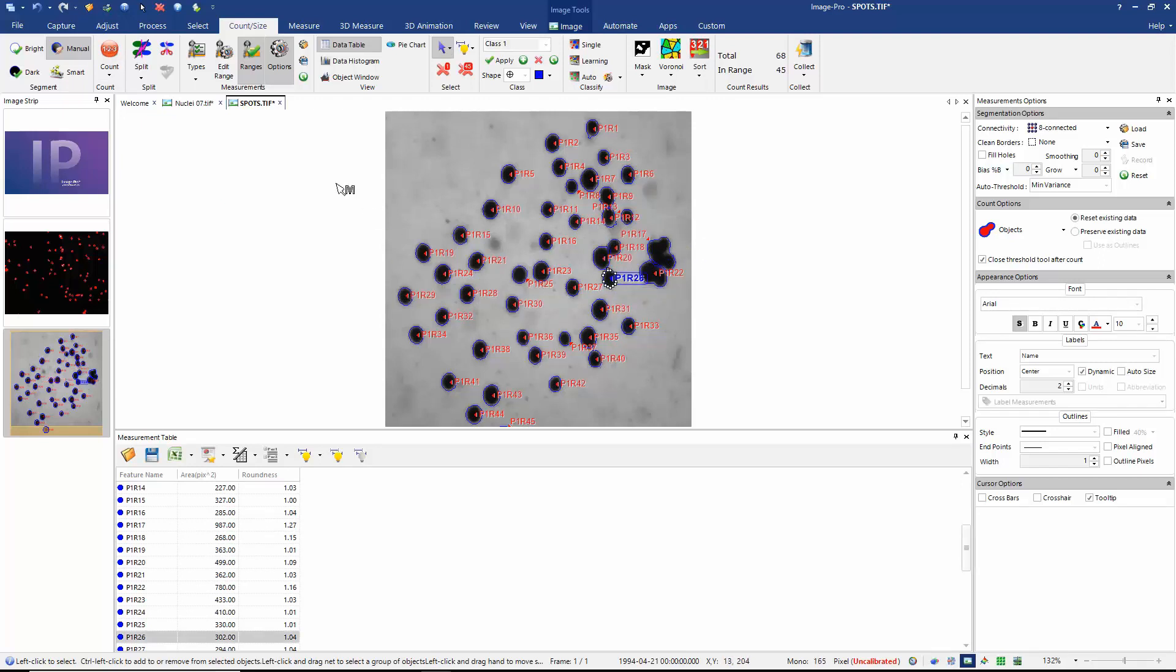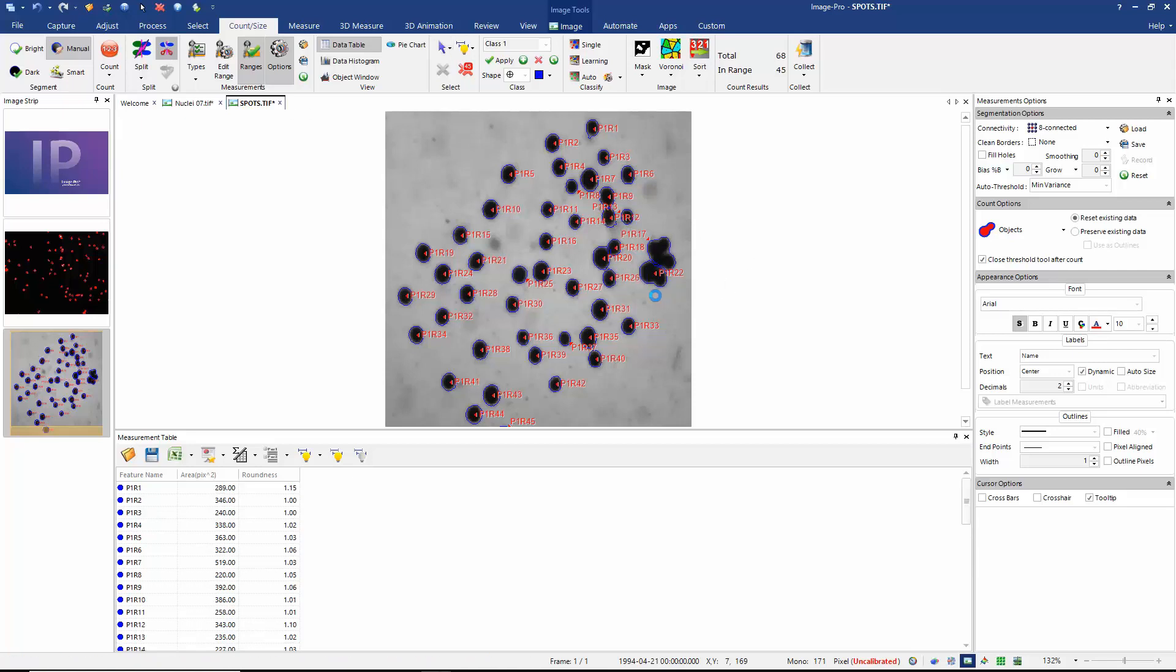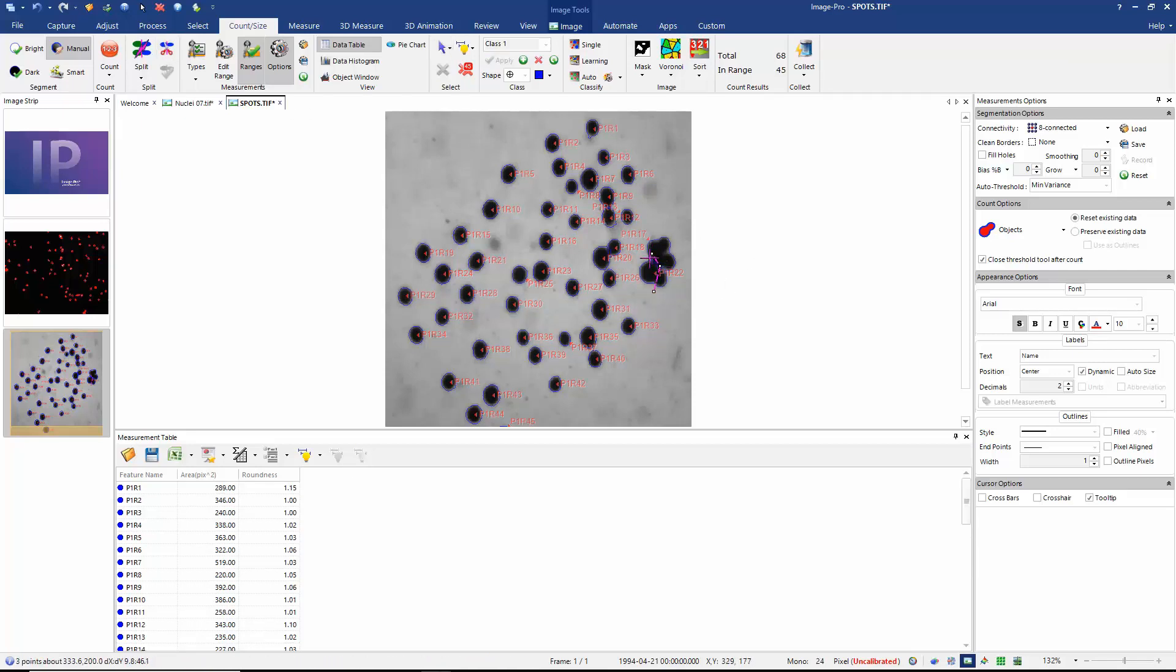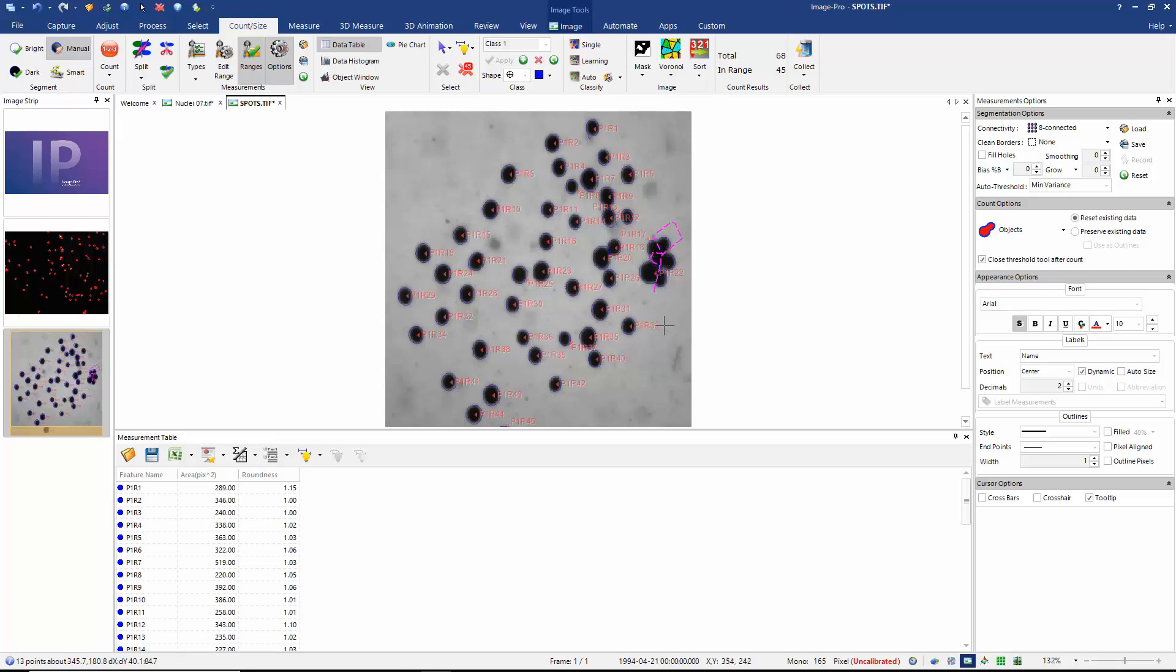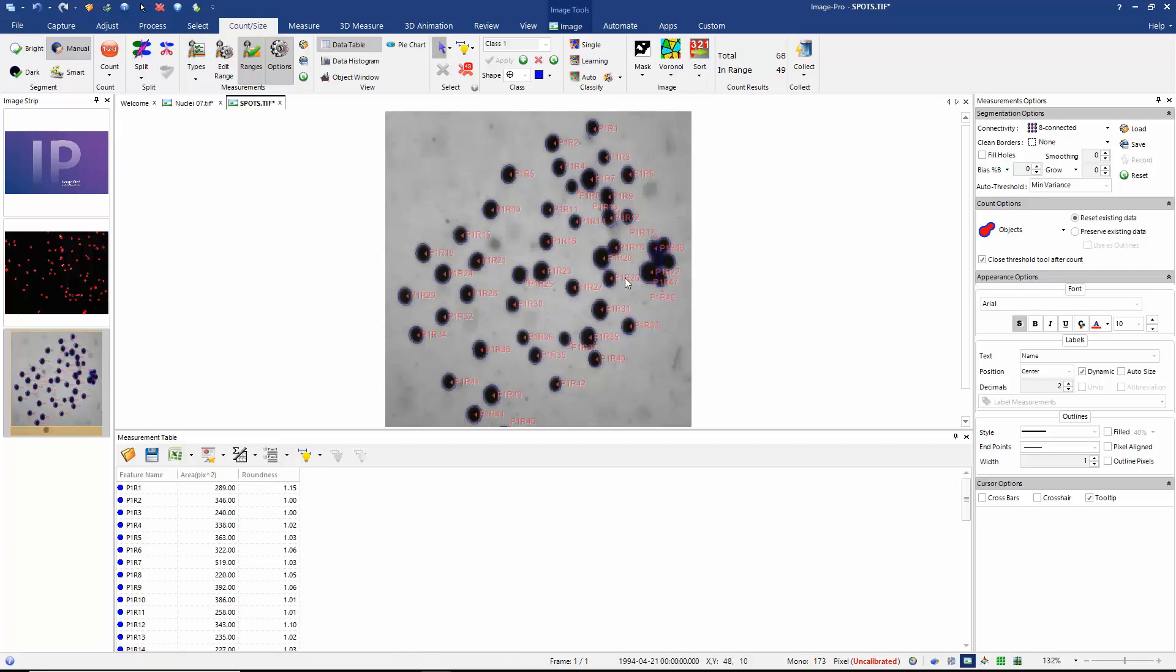We have some that remain joined here. So let's use the option to manually split those. So I'm going to draw lines that divide these objects. And double click to finish the line. And then we execute the split. And now we have all of our objects correctly separated.